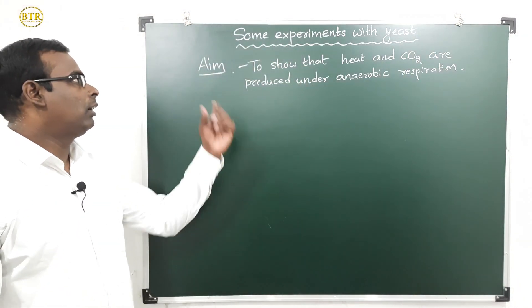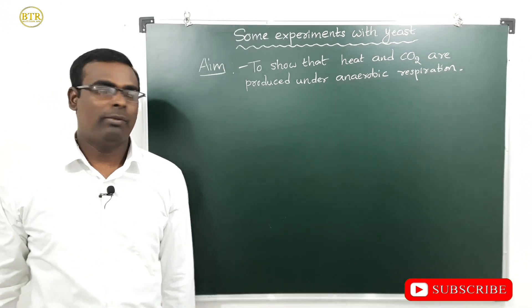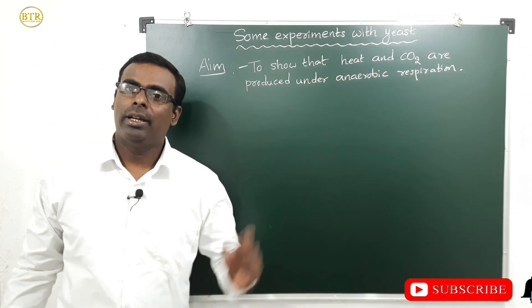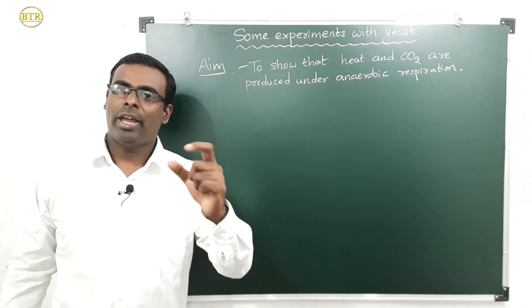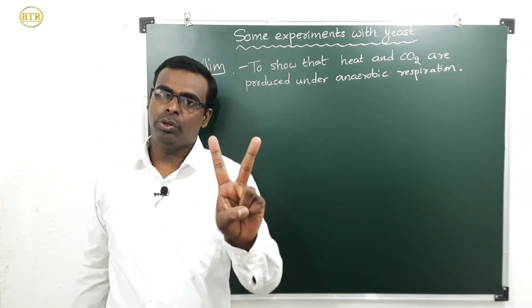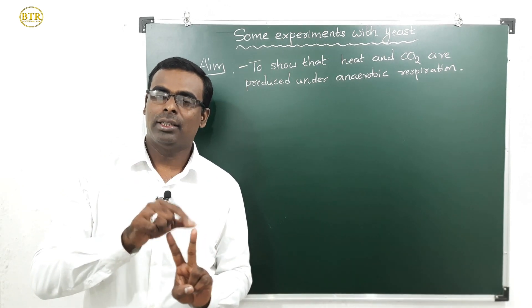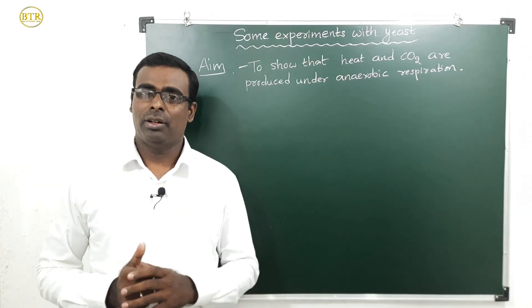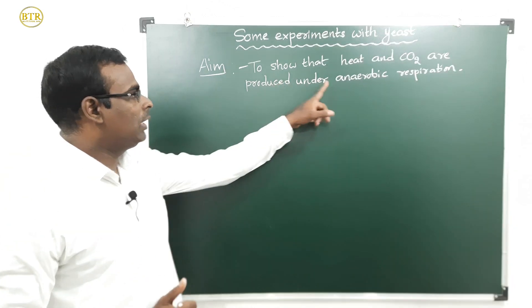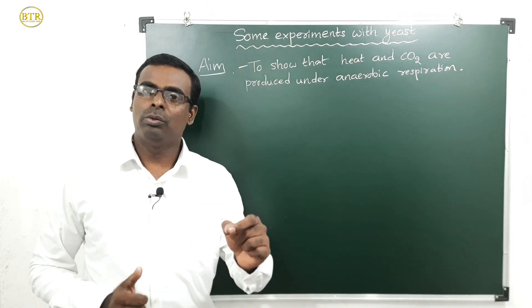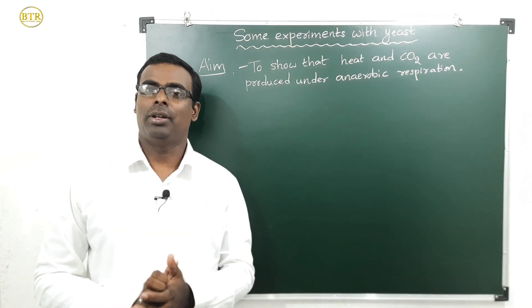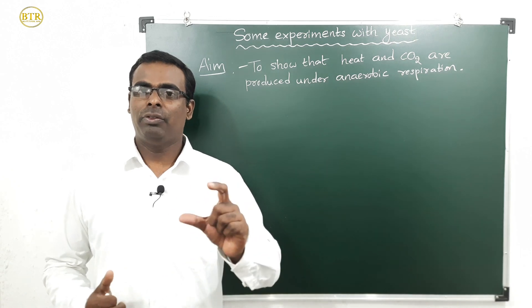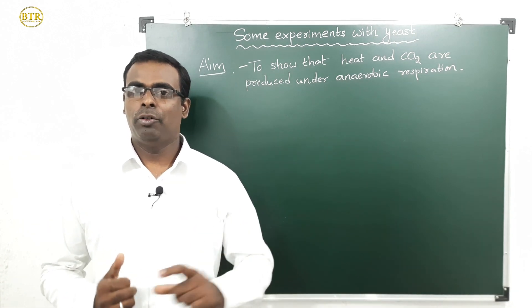This is the aim of the experiment: to show that heat and carbon dioxide are produced under anaerobic respiration. Respiration is of two types — one is aerobic respiration and the second one is anaerobic respiration. In this lab activity, we are going to prove anaerobic respiration, not aerobic respiration.